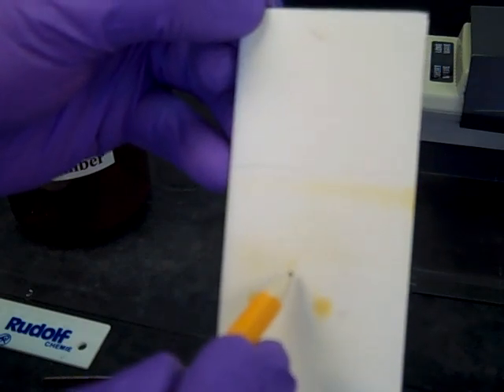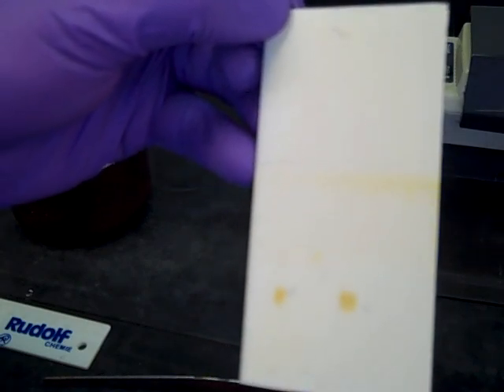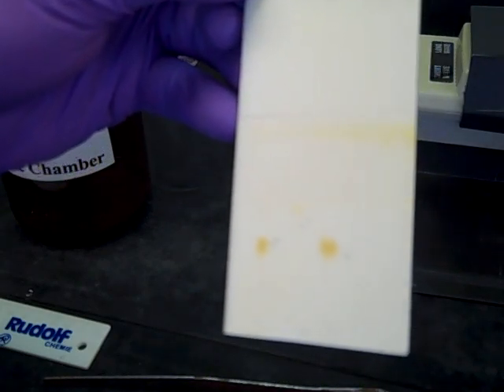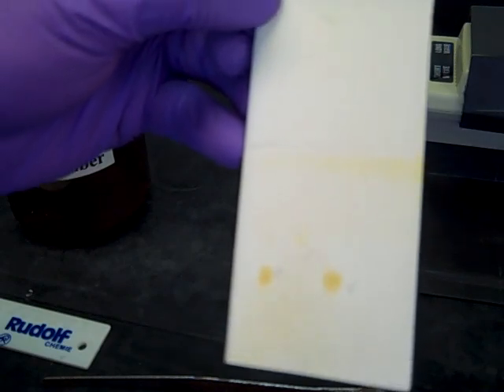It appears this spot also has a slight iodine stain, so I'll put little i's on there to denote that it stains by iodine as well as UV. At this point we've got all of our spots there.